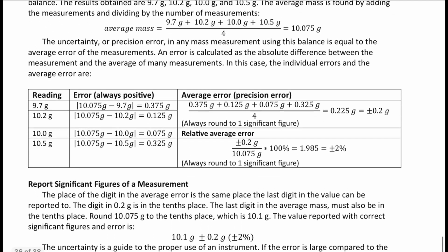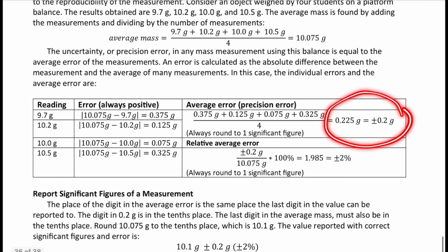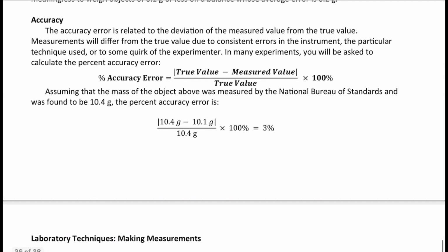You'll see that won't always work when you do your experiment in the lab. In that case, it won't work that way. You'll have to use this idea to figure out what's the last significant figure you can report.